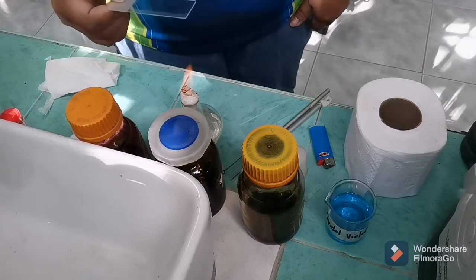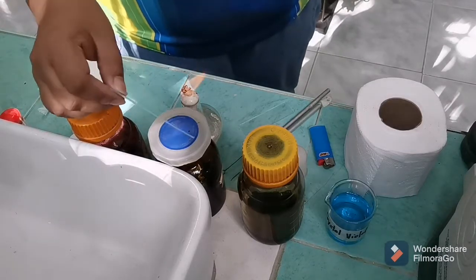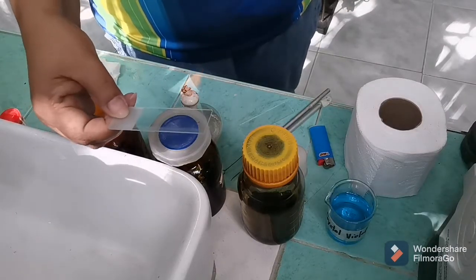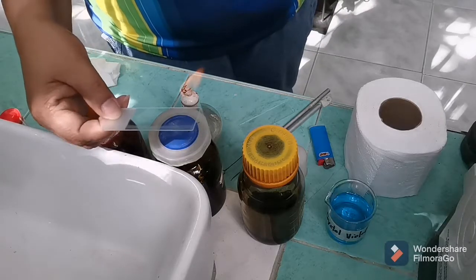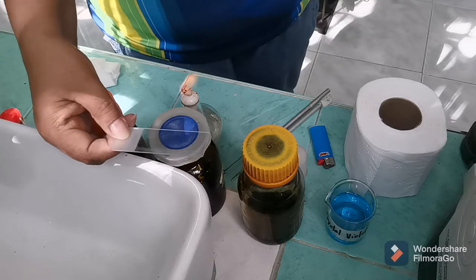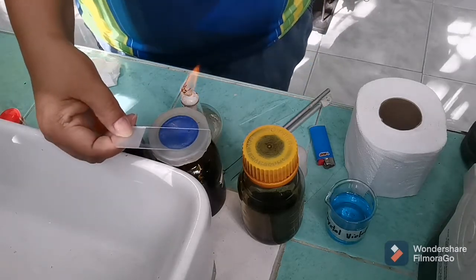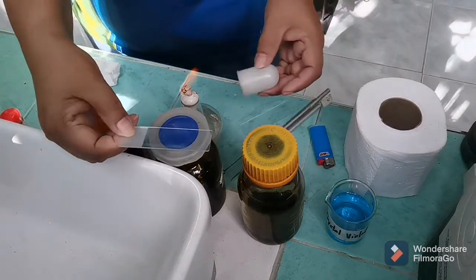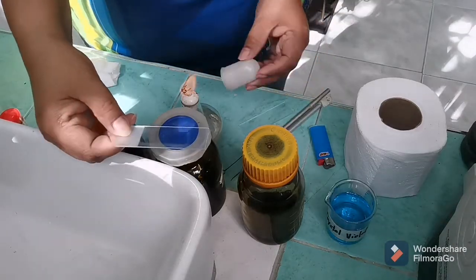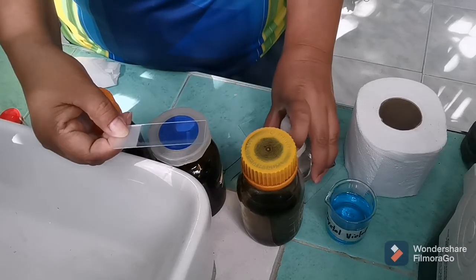Okay, it is now dry. If you look at this against the sun, I could see some stained portion of the glass slide, a blurred portion. Since I will no longer be using the alcohol lamp, I will now turn off the fire.